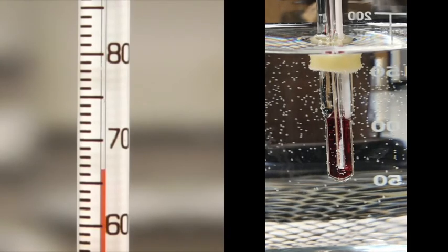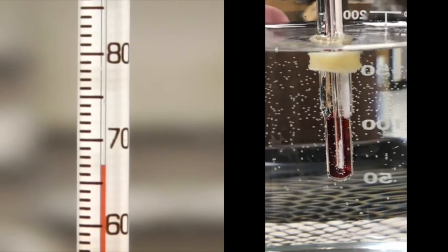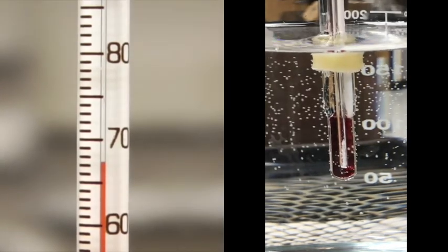It doesn't look like it. I'm going to tap this to get rid of some of those bubbles. Trying to knock some of the bubbles off. Okay, so we're still going up in temperature, so we want to watch our crystals there.